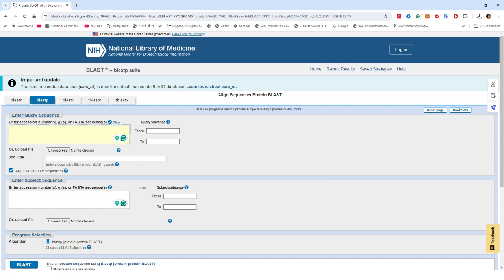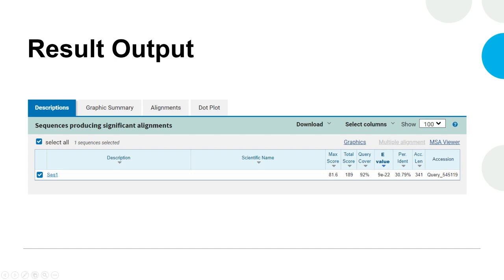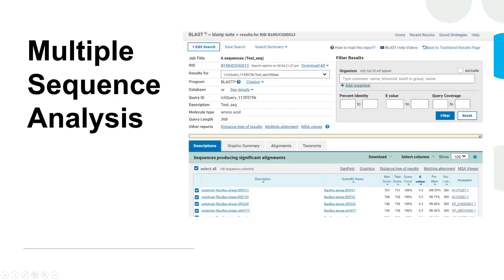We can place the query sequence in the top section and the one or more sequences to be compared in the second section. Then run BLAST and we might get an output depending on the significance, which also depends on the BLAST parameters run in the background.